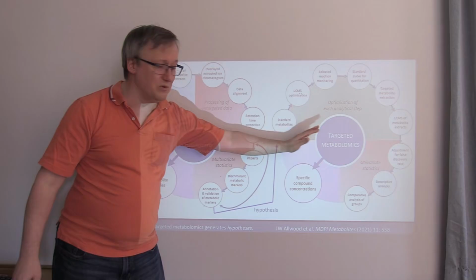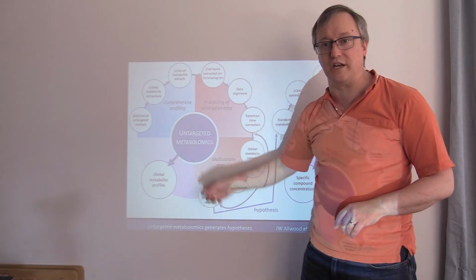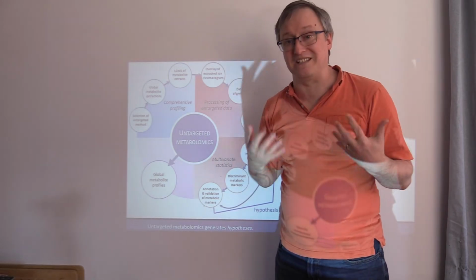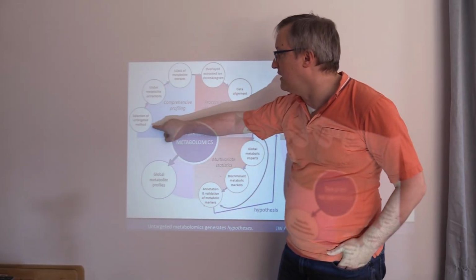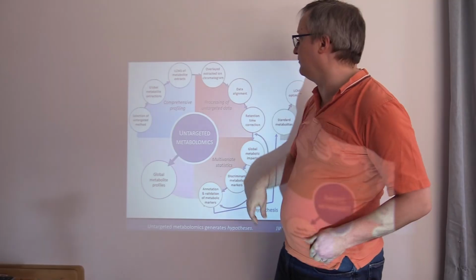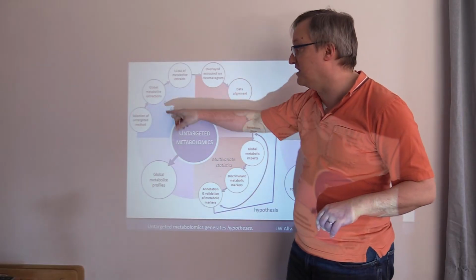And that brings us to the difference in how these kinds of experiments look from a high level. So let's start over here with an untargeted experiment. Typically at this stage, we are trying to evaluate what metabolites exist in the mixture altogether. So this comprehensive profiling means that we're going to be starting with selecting an untargeted method that will tell us about compounds of this type. Not just metabolites, but a particular subclass of metabolites that are of particular interest in this case.